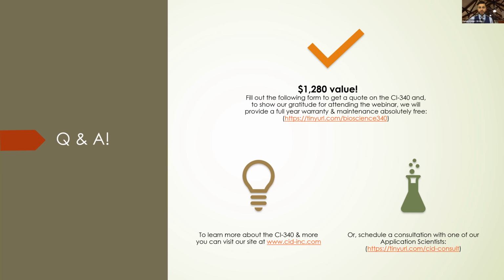Now I am going to go to this Q&A box. All right, so the first question we have is, can Arabidopsis and such small plants be measured with the instrument? Definitely. In that case, you can use either open or closed with some of these smaller chambers, I would suggest. Or if you wanted to get the entire plant into one of the larger chambers, you'll be able to use that as well.